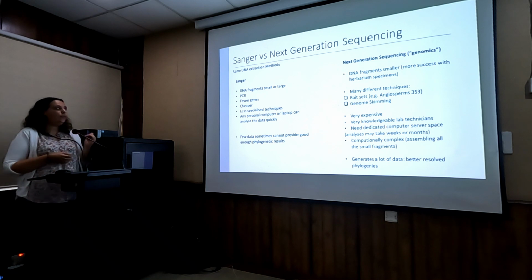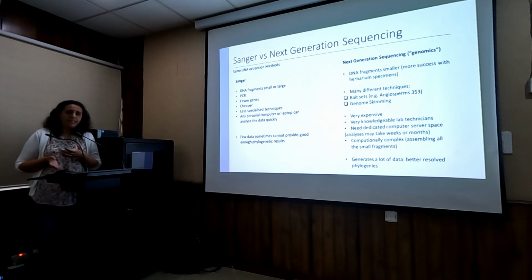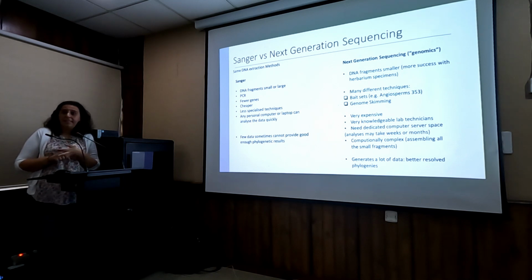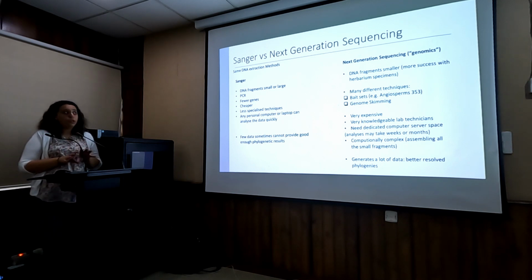So if you use Sanger, you can either get small or larger fragments of DNA. You have to do PCR. You use fewer genes. It's cheaper. The techniques are far less specialized, so usually undergrad students, MSc students can pick them up very quickly, and it's fast to go through techniques. And usually any personal computer or laptop can analyze the data very quickly. So that's the good thing about the Sanger data, that if it suits your project, that's great, because it's so much easier to work with it.